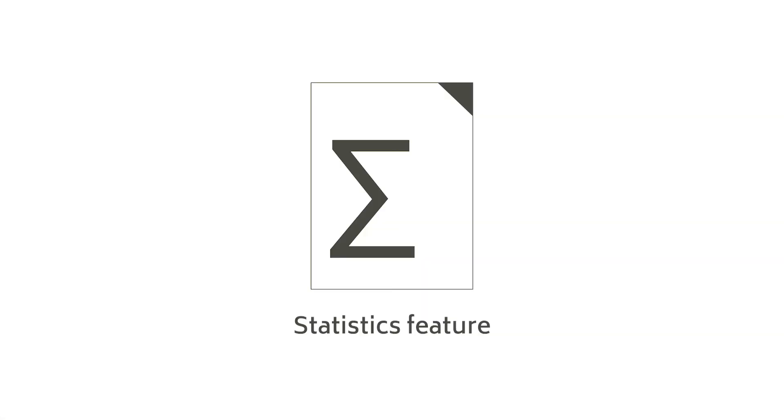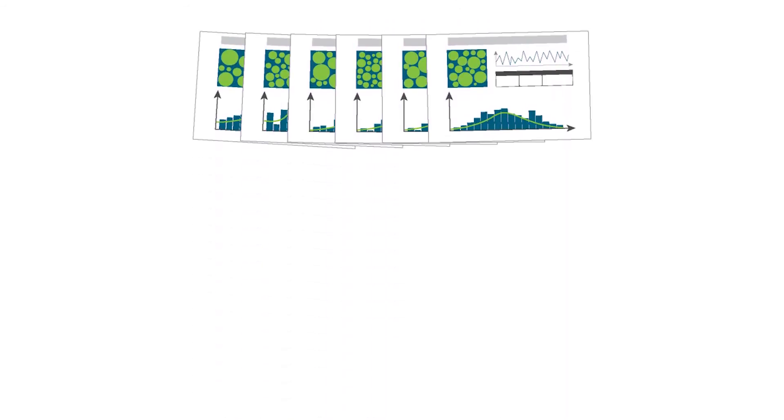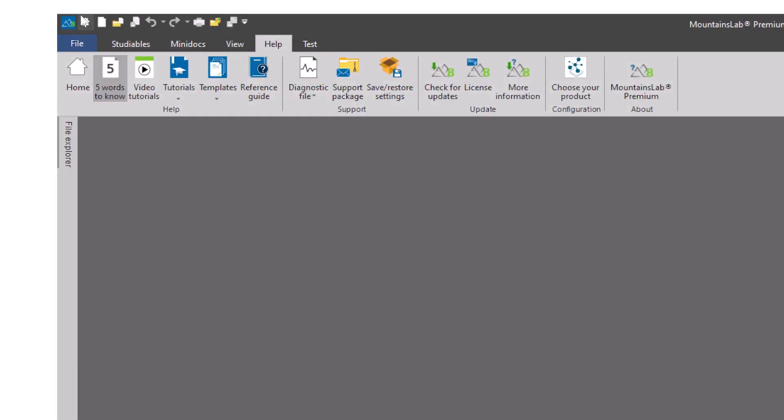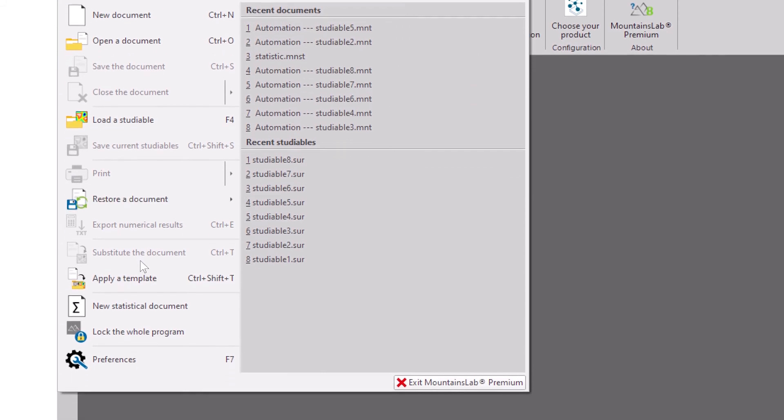One last tool I'd like to show you is the Statistics feature. Mountains lets you automatically analyze measurement data populations, whether they be static or dynamic. Go to the File menu and choose New Statistical Document, then select the folder containing your data sets.